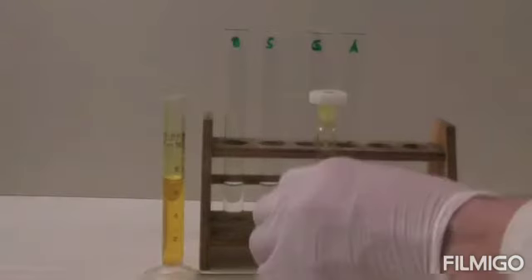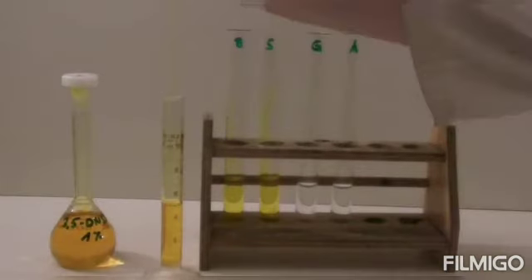Then into each of the test tubes we have added 1 ml of DNSA reagent. After taking 1 ml DNSA reagent in each test tube, mix all test tubes properly.